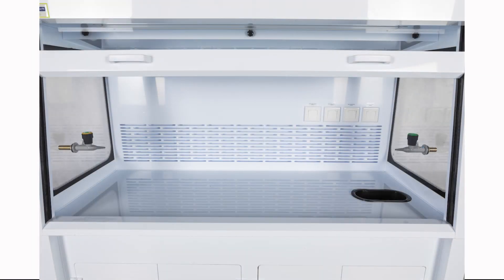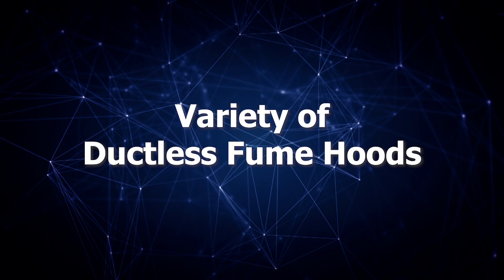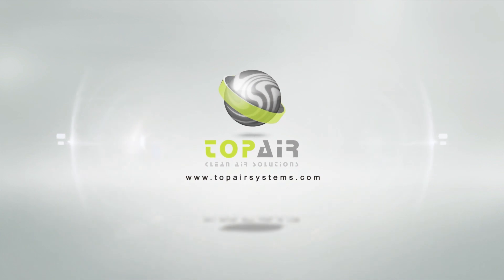The hood is available with a variety of accessories including electrical outlets, sinks, taps, and more. Top Air also offers a variety of additional ductless fume hoods in fully customizable sizes. Top Air's ductless fume hood: easy to use, safe, power-saving technology.